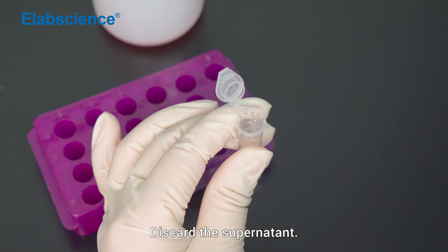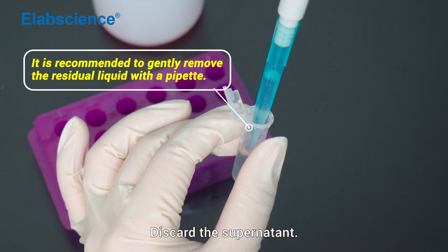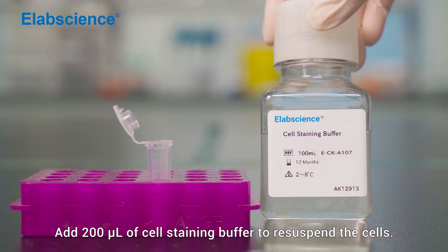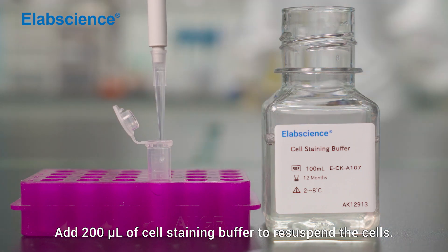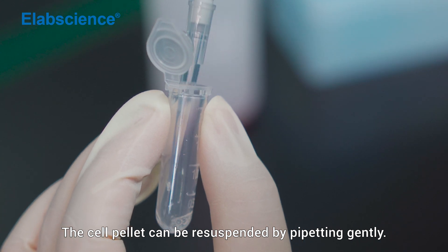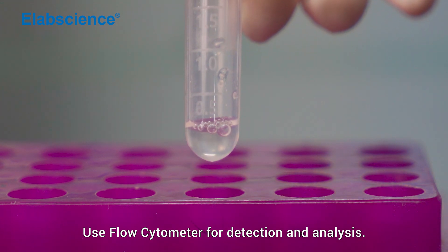Discard the supernatant. Add 200 µL of cell staining buffer to resuspend the cells. The cell pellet can be resuspended by pipetting gently. Use a flow cytometer for detection and analysis.